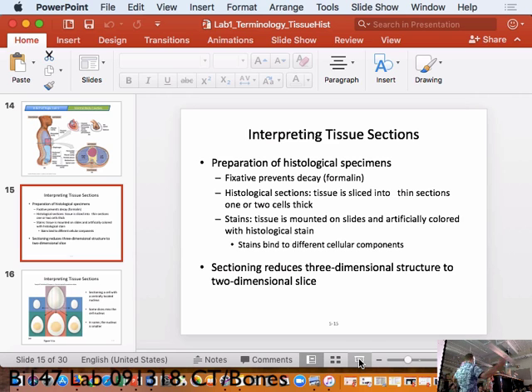There are like 200 different tissue types or cell types in the body. I have picked out 6 of them that are actually going to be useful for us to understand. All right? And I picked out a slide for each of those. They're in those little cases there, and we're going to look at them today. So starting from the back, I probably should have organized them in reverse order, but I'm going to start with the one in the very back.